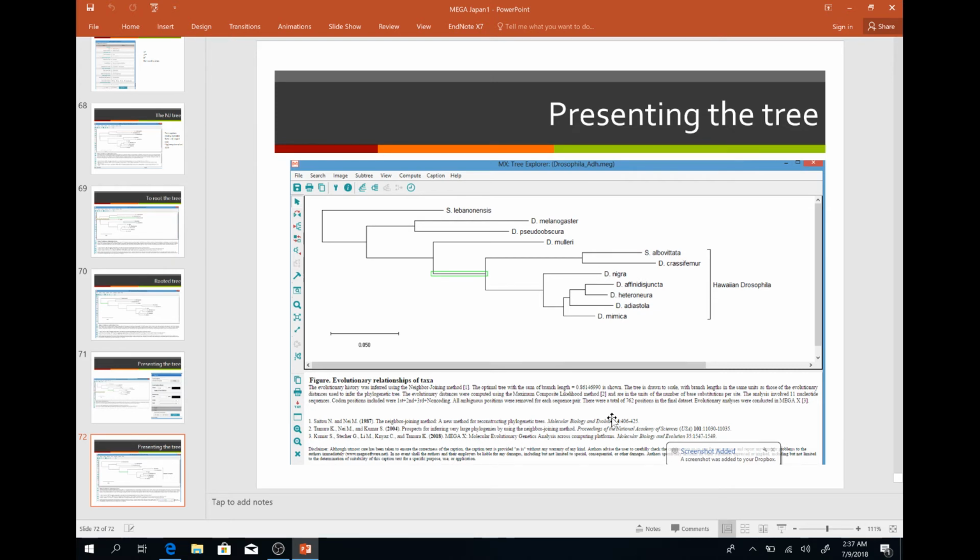As you generate these big phylogenetic data sets, which contain a huge number of missing data in different parts of the alignment, it's good to maybe select 70%. So 50-50 minimum, but I would say 70%. So at least 70% of sequences have a base at each position.